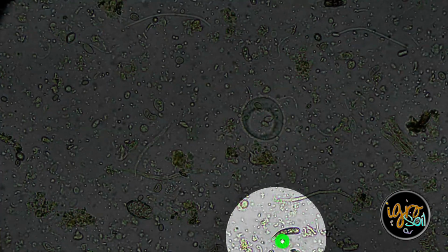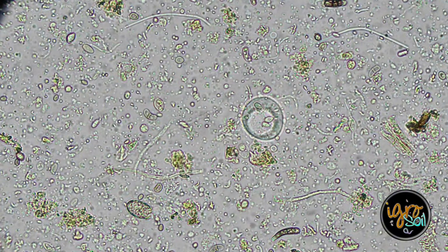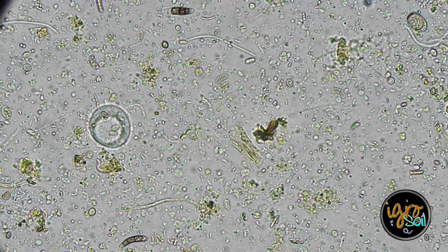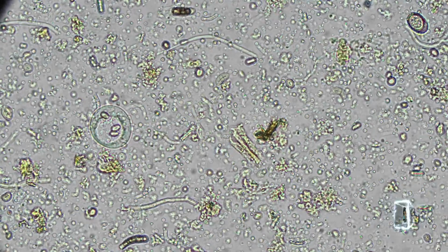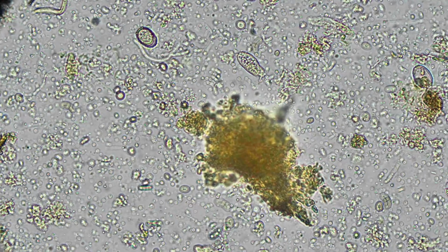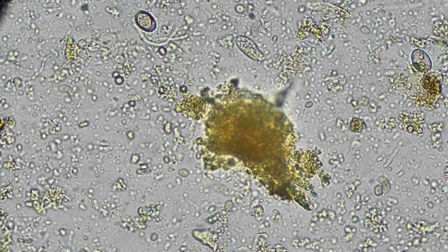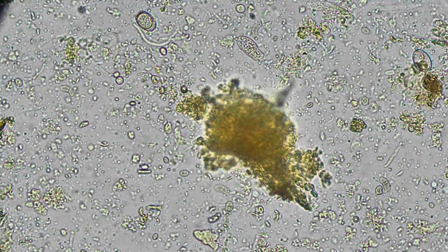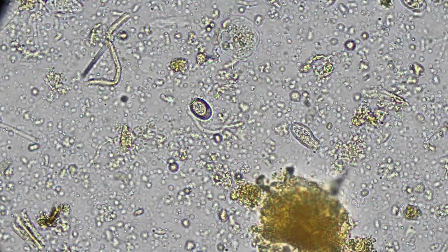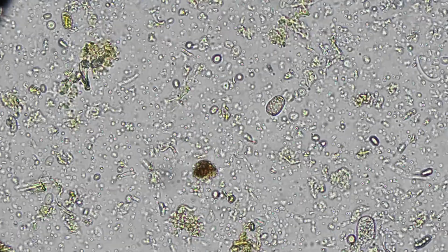You see that? And then you've got these little lines, I don't know if they're called septa in spores, but definitely a lot of spores, which would make sense. I mean, these are mushroom blocks. Lion's mane, blue oyster, and maybe reishi blocks, or actually yellow oyster. I wasn't getting the reishi back then.